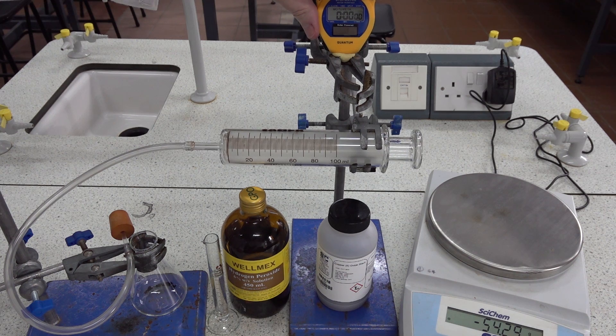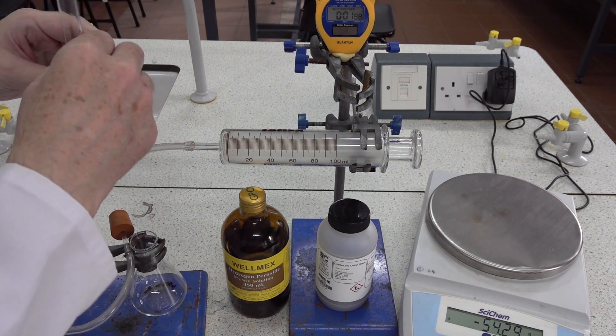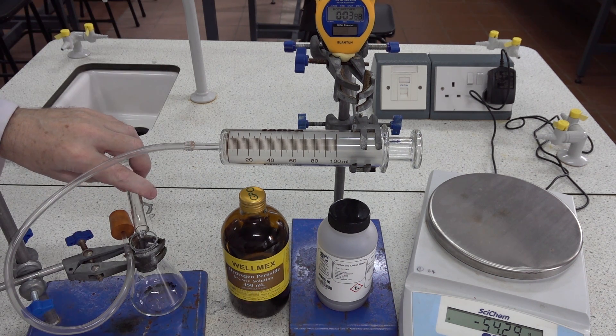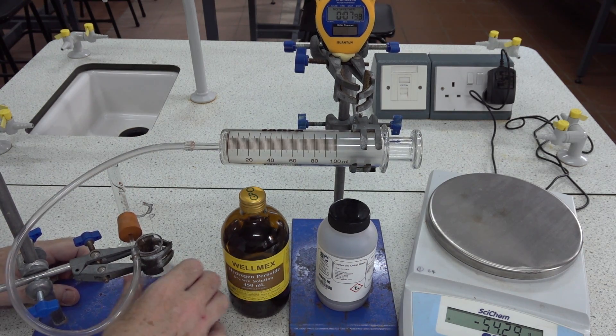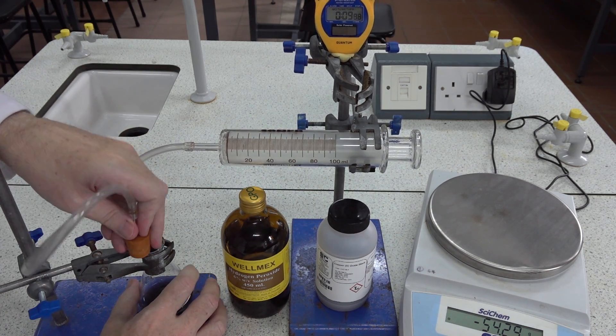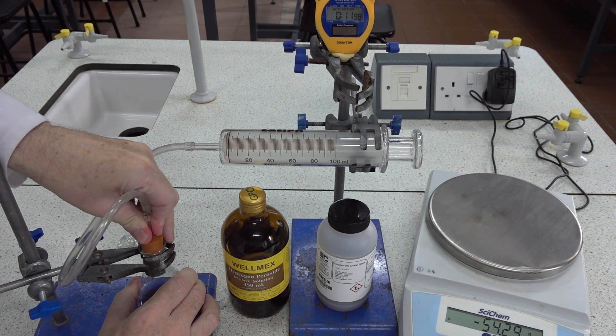Start the clock, add the hydrogen peroxide, give a little bit of a shake and insert the bung securely.